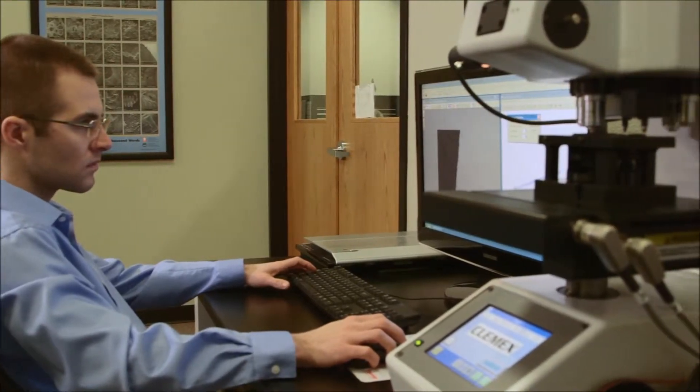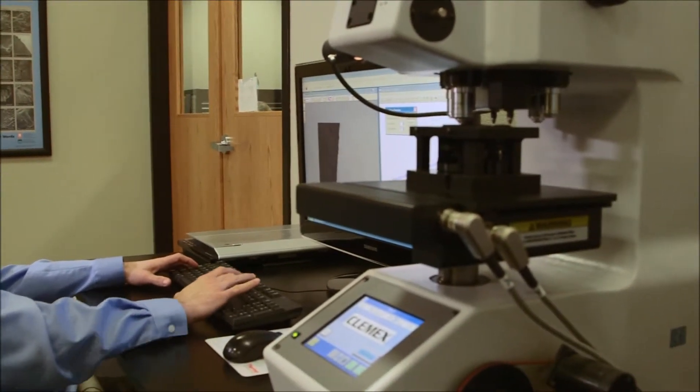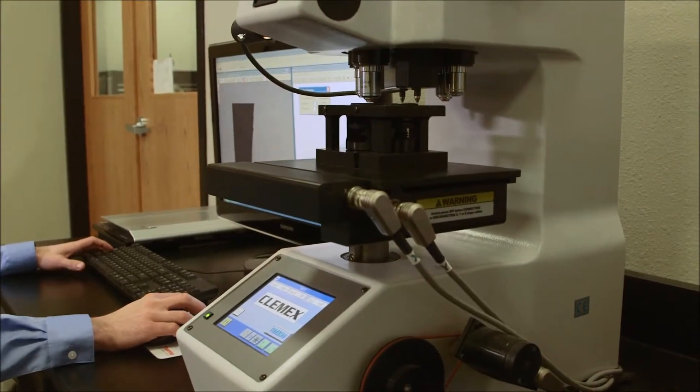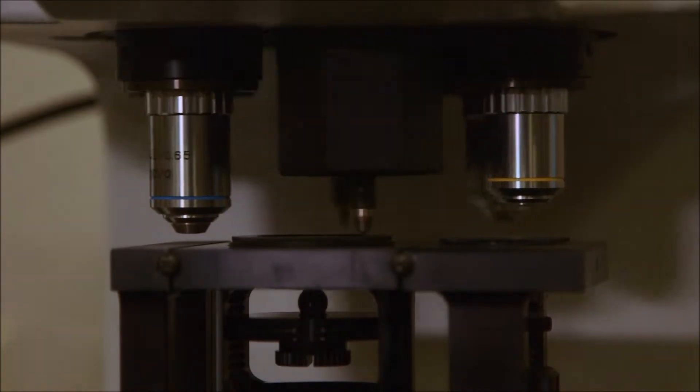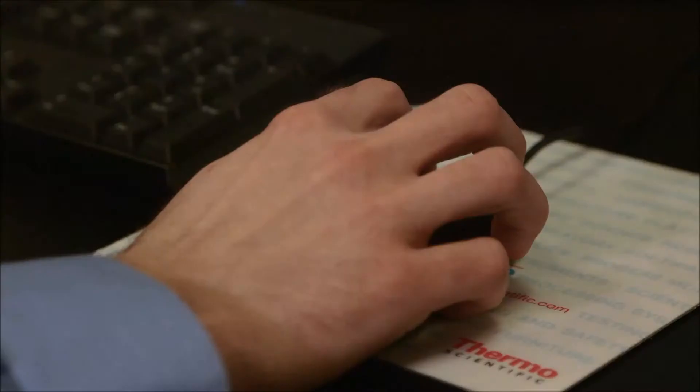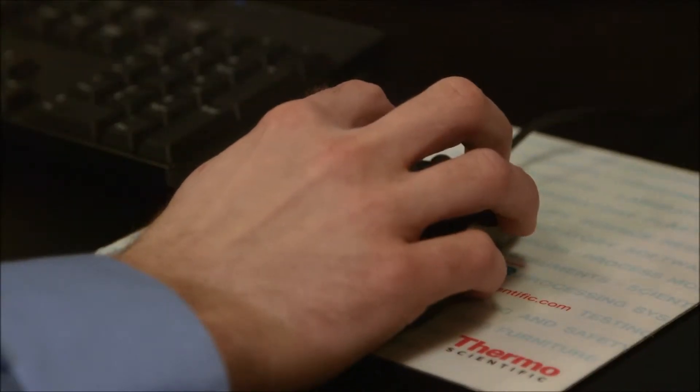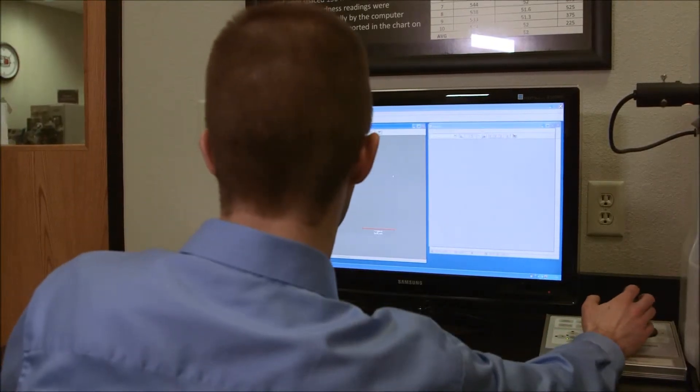So what we have is we have a Clemex automatic micro hardness tester that can go in and identify these different phases that make up our coating. So this could be our carbide materials that provide the extreme abrasion resistance, or it could be the matrix material that we use in between to ensure that that coating doesn't chip off in the field.